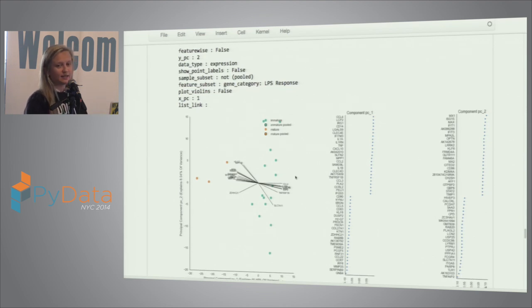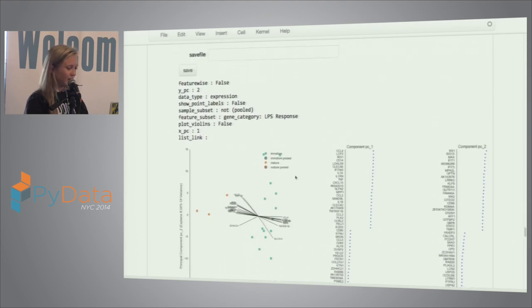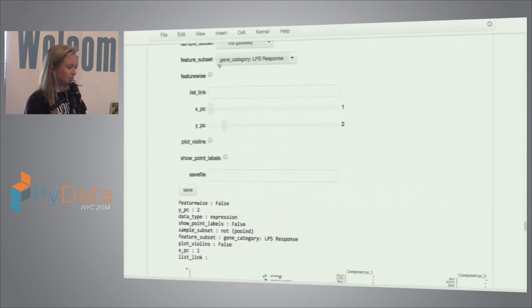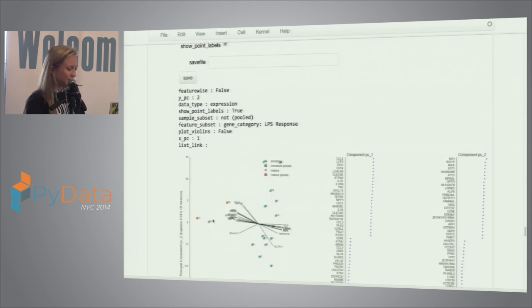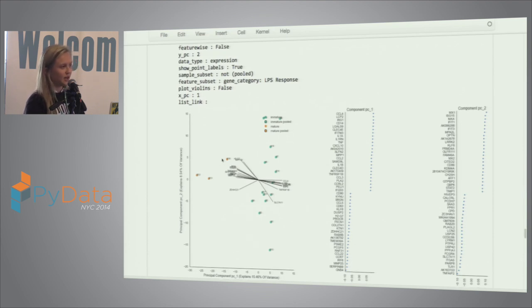And this is basically exactly the figure from the paper, which is really cool. And now what we can do is, so we have these mature samples, and again, this would be really great to have a hover object, but we don't have that yet. So these orange ones, I apologize if you can't see it, but they are S12, S13, and S16, as we saw before.